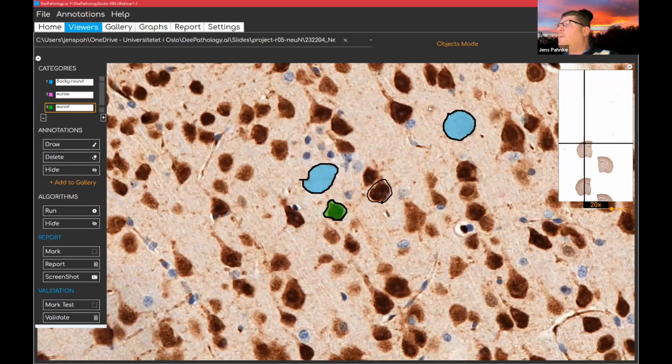But we need some good examples always. That's very important. These are very dark. And it's important that you choose objects that yourself can segregate with your eyes. If you choose similar things, the software has the same problem as you have, and then it doesn't make sense to show some weaker ones. Go for this one here as well.